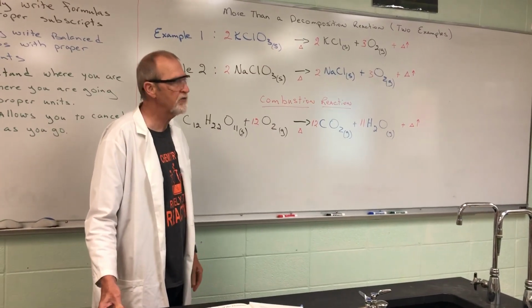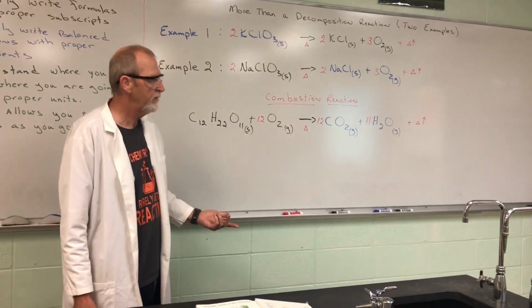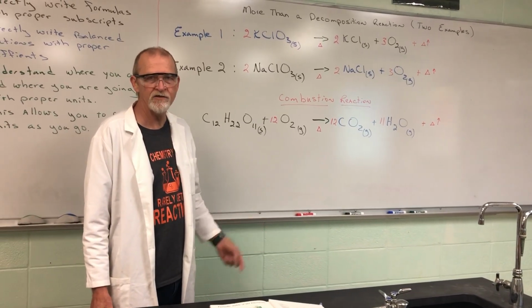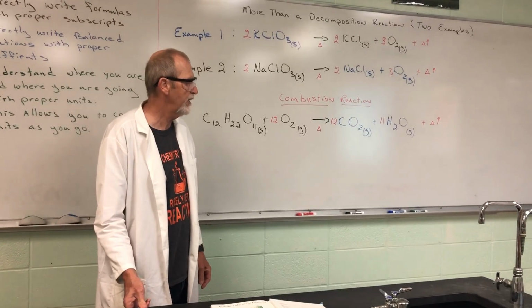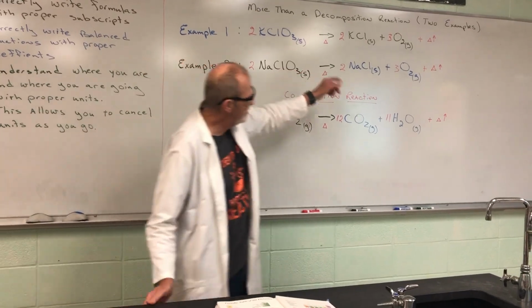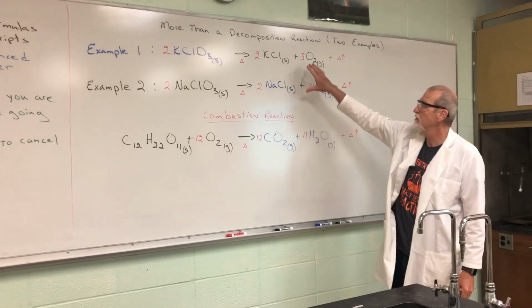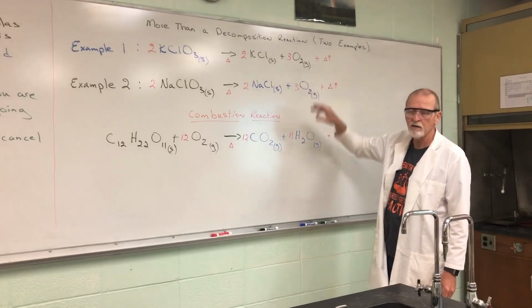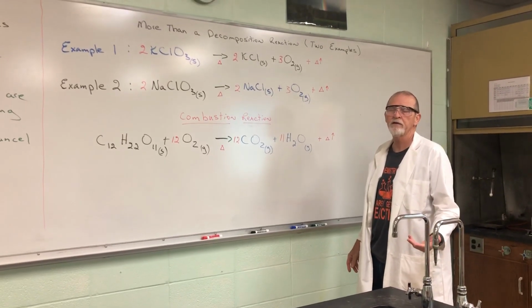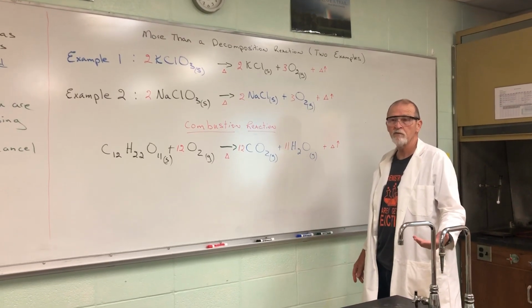In both cases, we're going to react it with a sugar that's in a compound. We don't particularly care for licorice, so we're going to use that as our source of sugar today. And in both cases, oxygen is released, as you can see in the reaction here. When you decompose these two chlorates, you're going to get oxygen released. Just like in a previous lab that we did, you had the carbonate, like copper 2 carbonate, when you decomposed it, it released carbon dioxide.